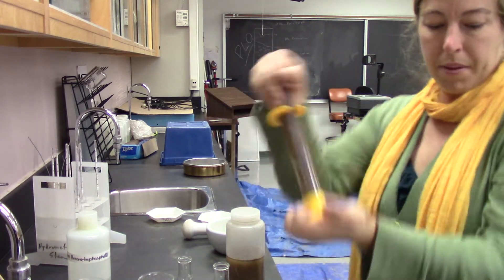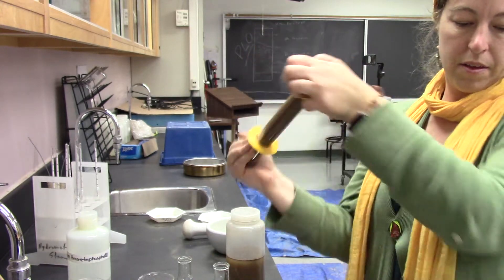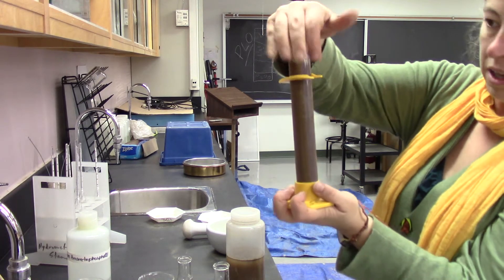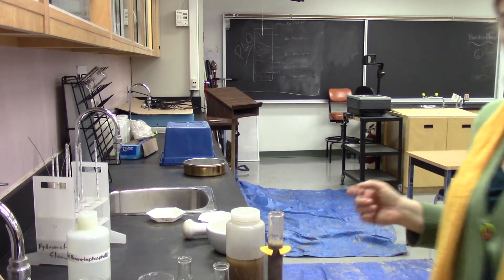All right, I got this one mixed up. I'm just waiting for an appropriate time to start. Now I'm going to start the one minute timer on that one.